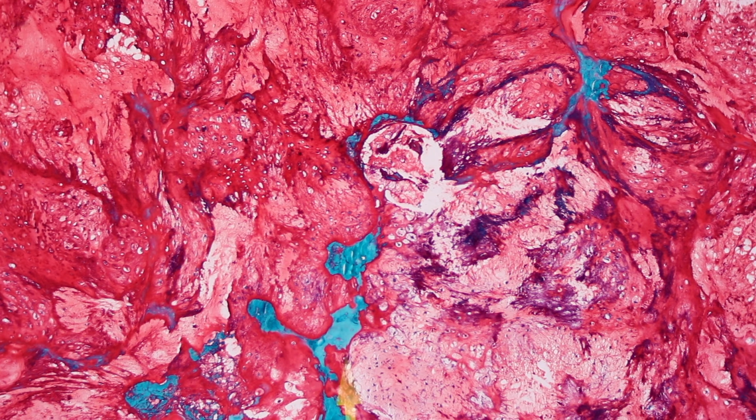I think those are bone because they have lacunae and so on, right? Yeah, I think this is bone, but it's at the very periphery of the tumor, and when you think about it three-dimensionally, those cartilage nodules are surrounded by bone. When you have a nodule of cartilage, a layer of bone surrounding it, and on the other side a portion of a nodule of cartilage, and you cut it like this, it looks like there's bone being surrounded by cartilage, but it's just a plane of section. We're not seeing it three-dimensionally.